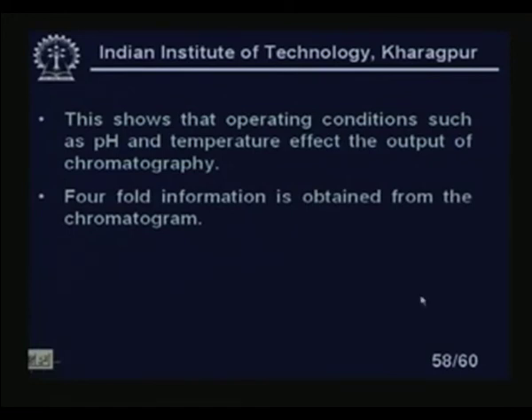Fourfold information is obtained from the chromatogram. What are the different informations I am getting from this chromatogram? Already we have discussed, but let us jot them down, one by one.